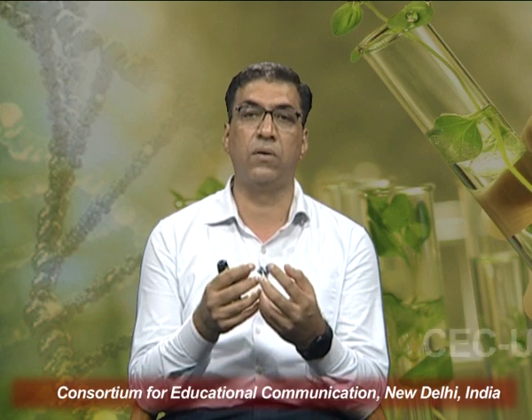Because we know that as there is growth of the cells, the number of the cells or the cellular density increases. So as the cellular density increases, the turbidity in the culture media also increases. Now the turbidity in the culture media can also be maintained by flushing out a certain volume of the cells. So this is how the turbidostat works, by maintaining the turbidity of the culture media.